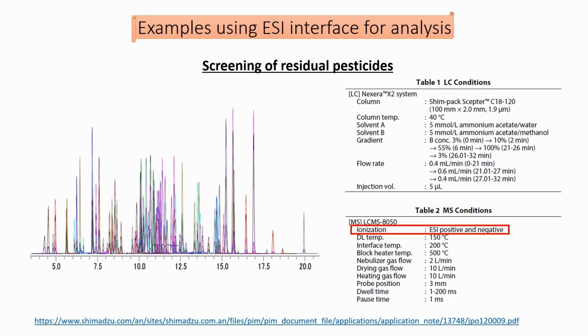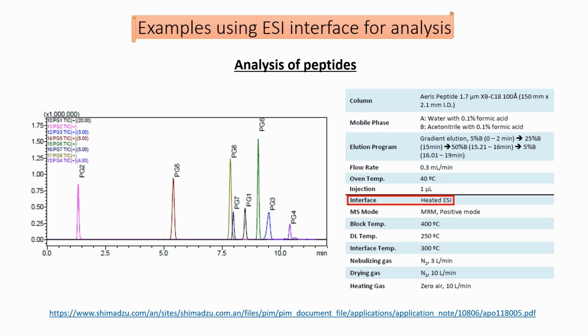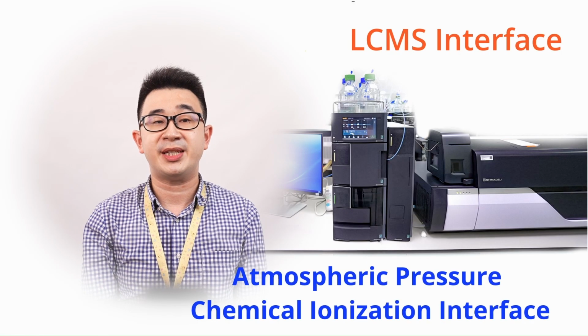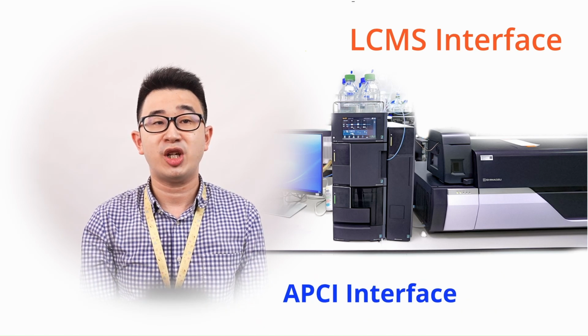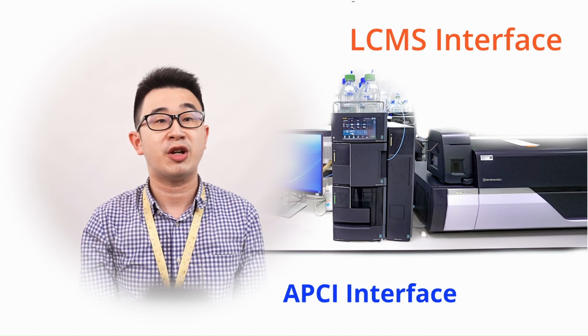Common applications that use the ESI interface for analysis are screening of residual pesticides, analysis of veterinary drugs, and analysis of peptides. Next, we will proceed on to the working principle of the APCI interface. In APCI, sample solution from HPLC is first vaporized by spraying it into a heater with nitrogen gas.